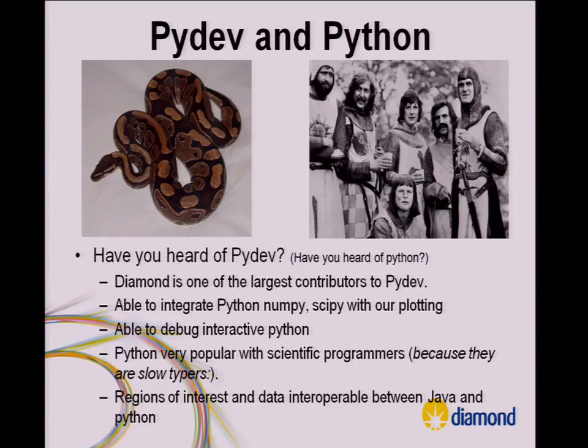So I mean, I showed you some GUIs, but a lot of the science we don't have GUIs for, and we never will because they're doing very specific tailored things.